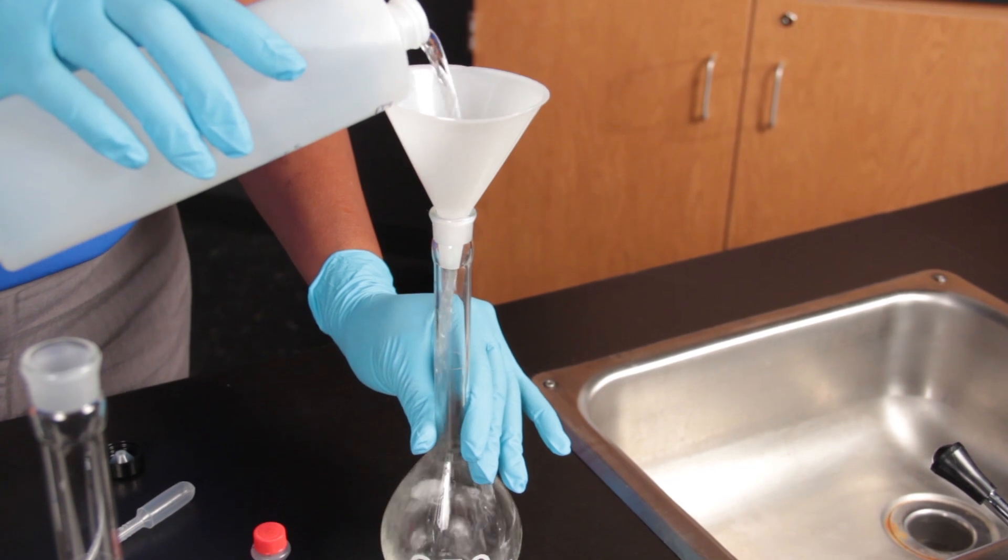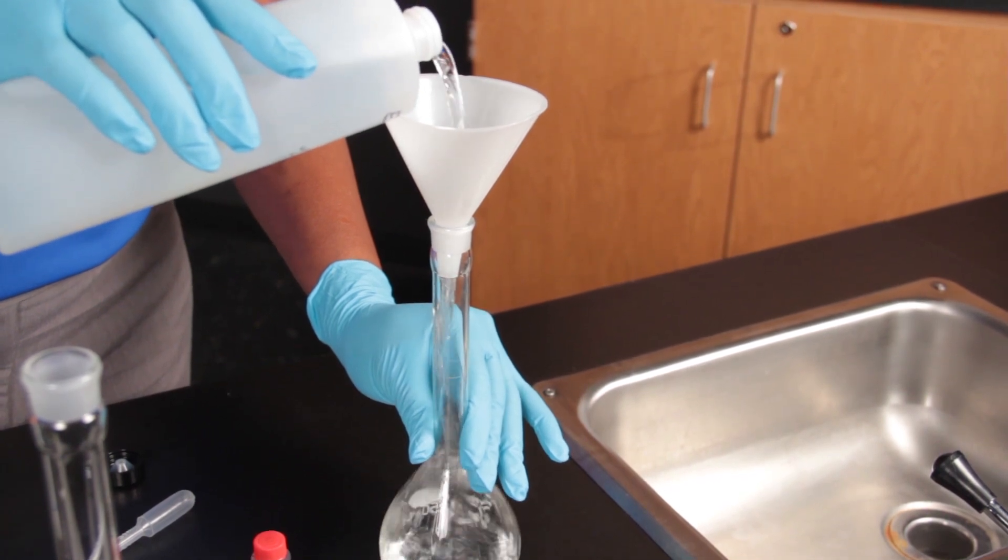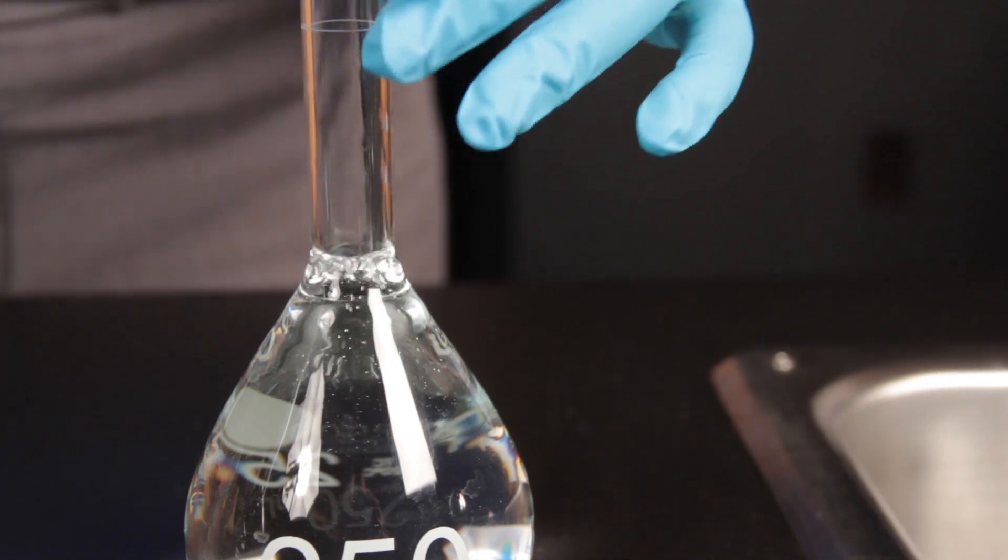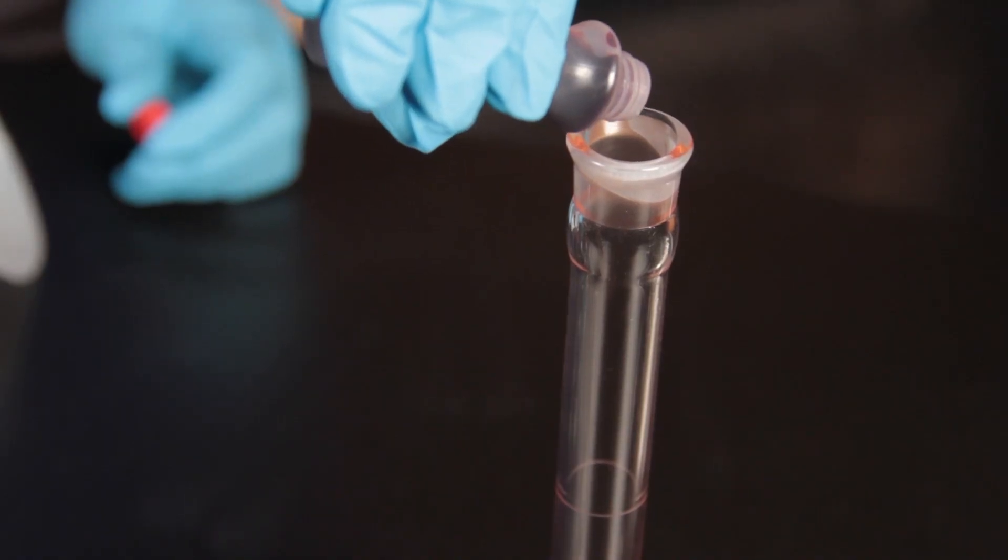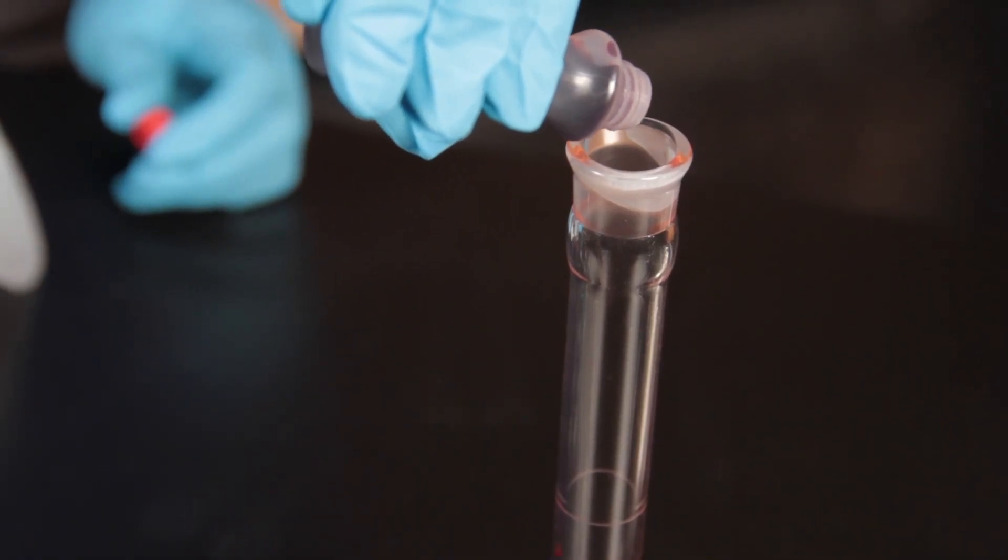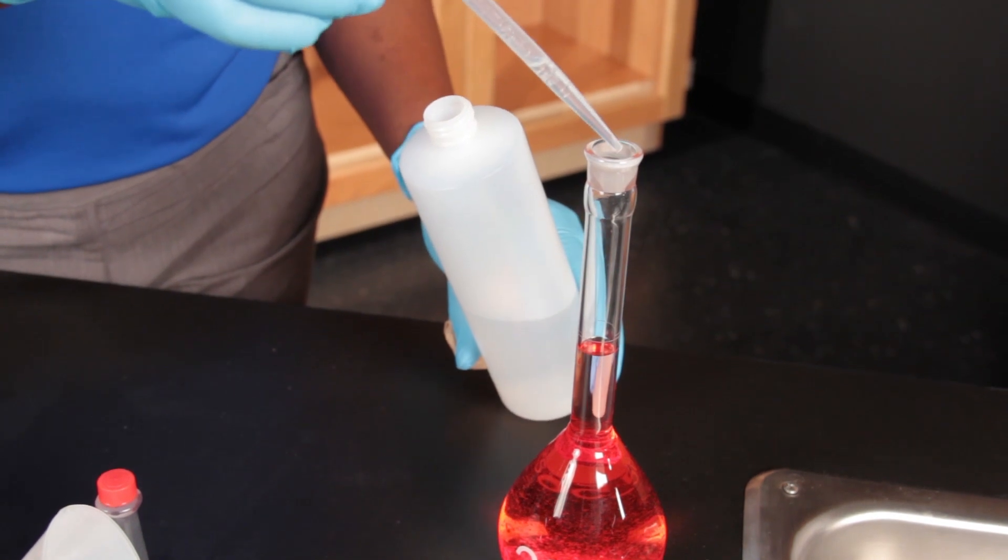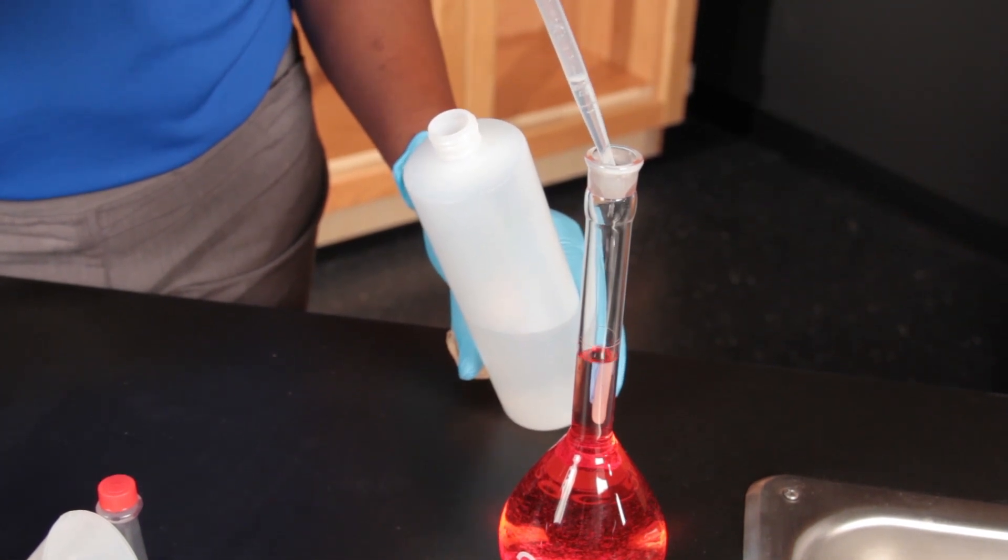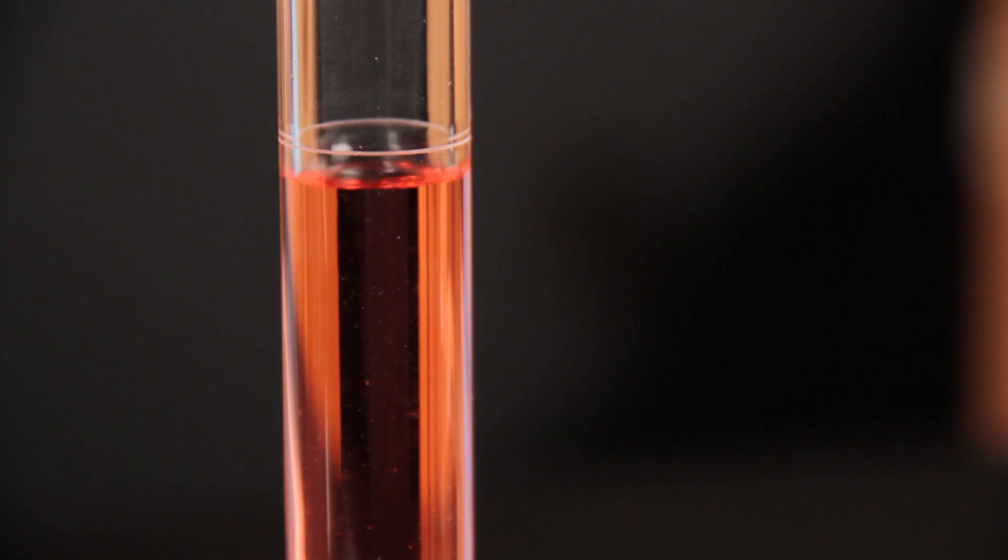Fill the first volumetric flask with ethanol, but not to the etched line. Add a few drops of food coloring to the flask. Now use a pipette to fill the rest of the flask up to the etched mark.